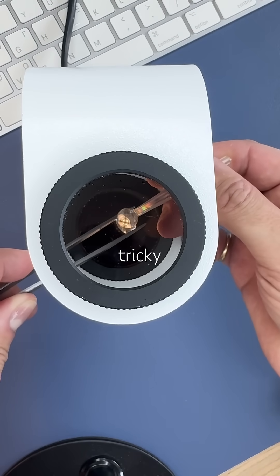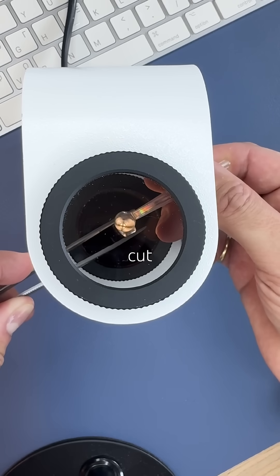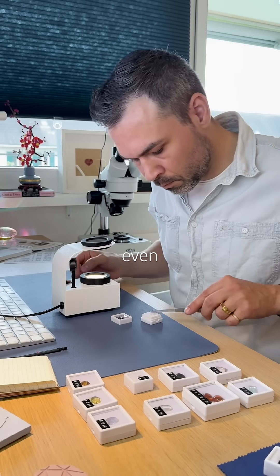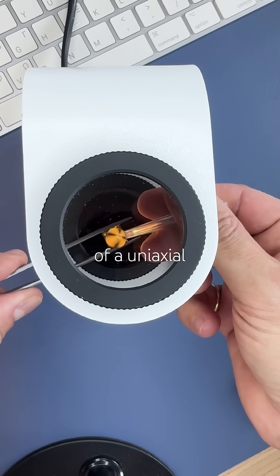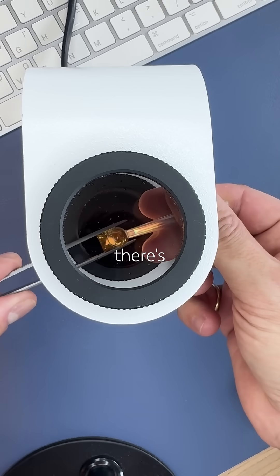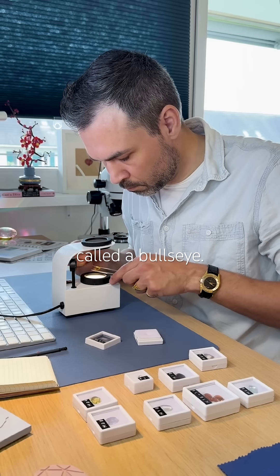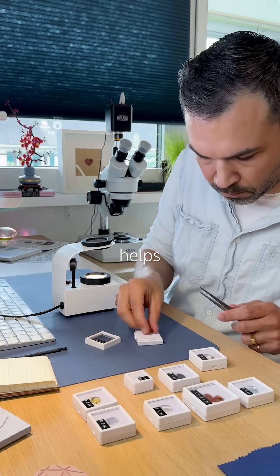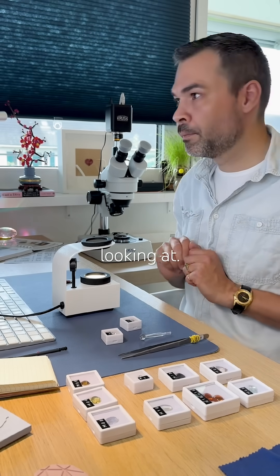Sometimes it's tricky to locate the optic axis because of the gem shape, color, or cut, but it's always there even if not found. There's also a quartz-only variation of a uniaxial pattern — instead of a cross, there's a glowing iridescent center. That's called a bullseye. That also helps us narrow down options as to what kind of gemstone we're looking at.